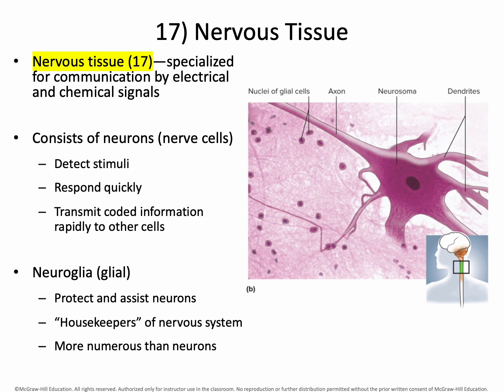So nervous tissue is made mostly of neurons, such as the large stellate, or star-shaped, cell with large appendages. The neuroglia, or glial cells, are smaller support cells, and you'll just see the nuclei of those cells. You don't typically see neuroglia in a neuron smear.